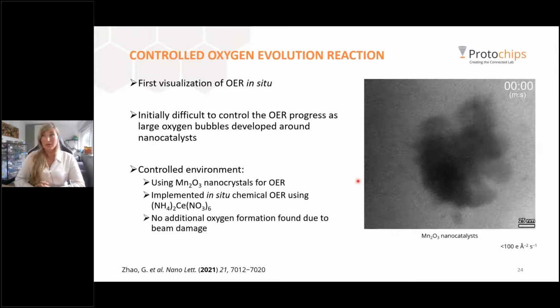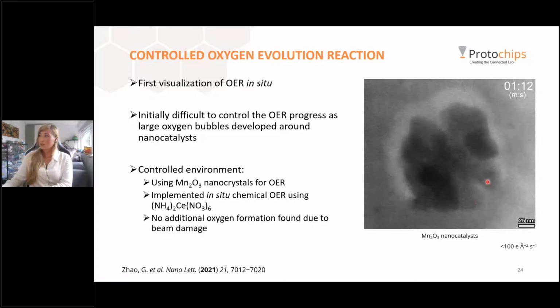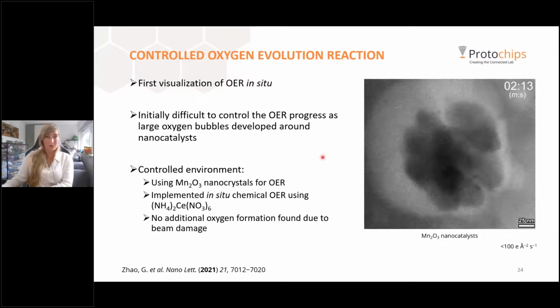An example from literature on doing some more oxygen evolution reaction in situ microscopy, also in liquids, is here from these manganese oxide nanoparticles. And their idea was not to do this with electrochemical stimuli, but using a controlled environment where they chemically induced this oxygen evolution reaction. You can see the manganese nanoparticles over here, and they use the chemical way of doing oxygen evolution reaction. And one thing that you can see over here is that when they start adding their electrolyte inside, it starts forming oxygen on the outside, and they can exactly see on the nanoparticles where the oxygen is formed and how this changes the nanoparticles over time.